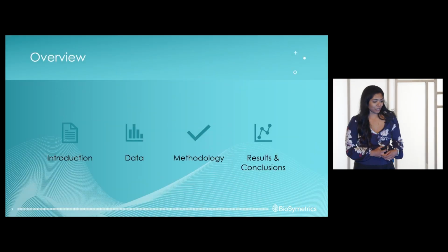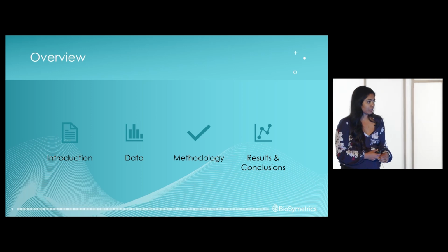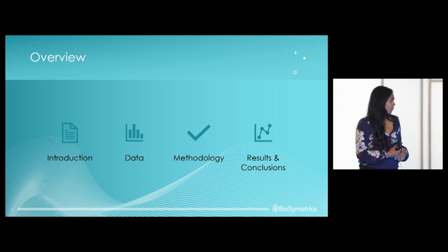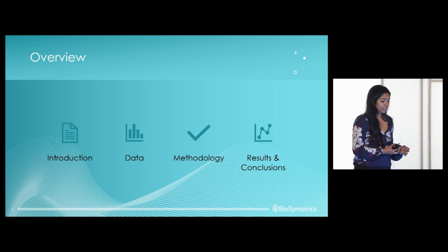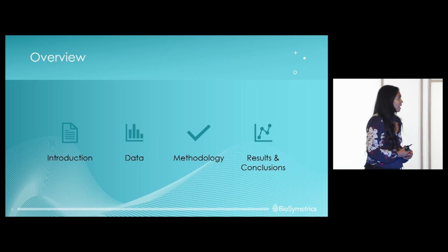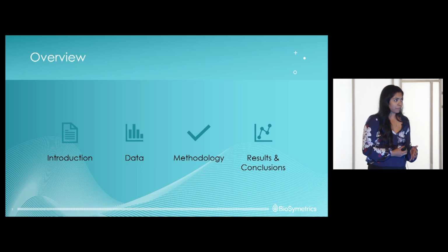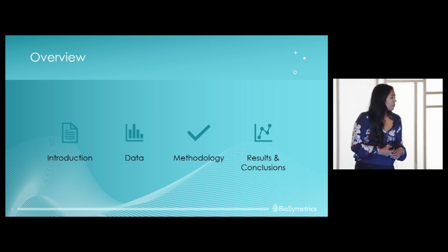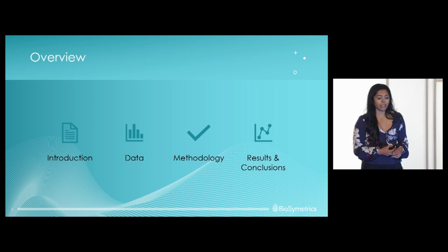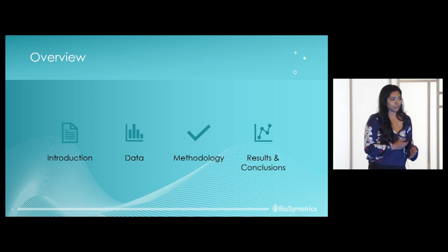Okay, so a quick overview of what we'll be going over today: an introduction into our model organism, so we use live zebrafish, the challenges associated with using zebrafish models in terms of live data, how we adapt to that, the inconsistencies with live data, the overall methodology of our pipeline, and then going into our results and conclusions, and then future directions.